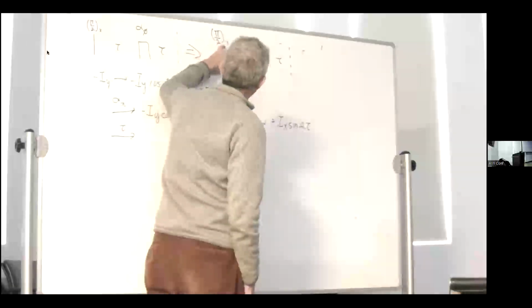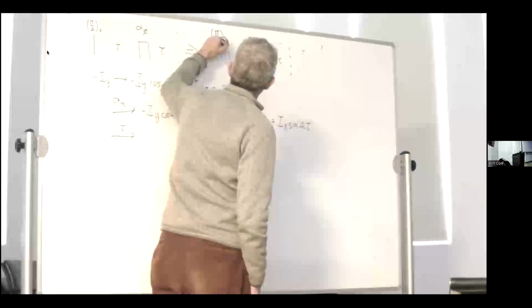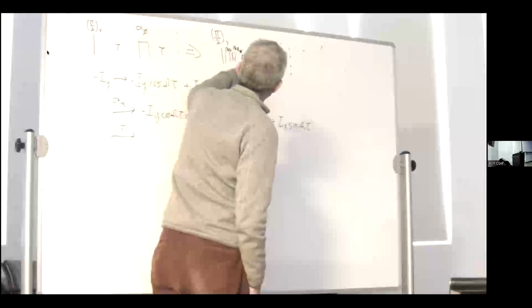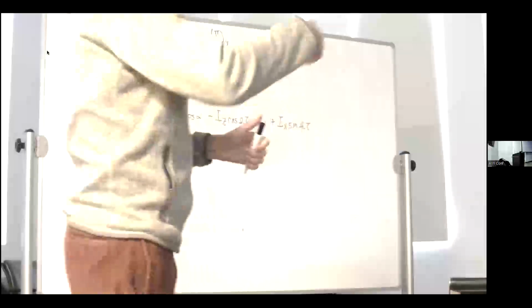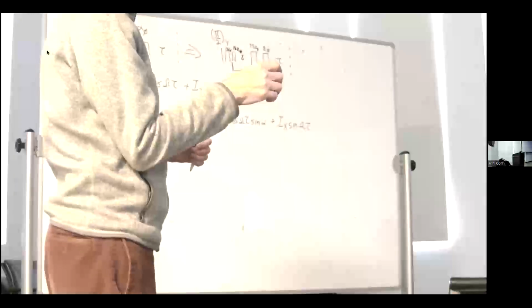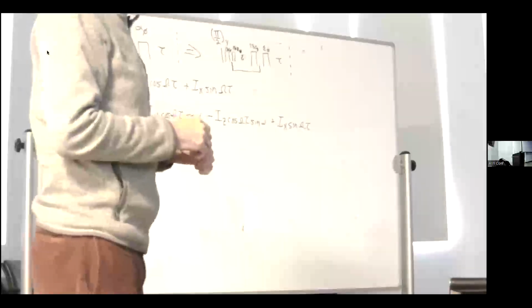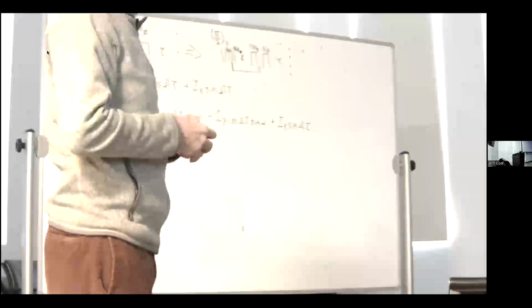And then I imagine sticking in a 180 phi and a 180 minus phi here. And I have this sandwich in which I've applied a 180 y pulse or minus y pulse, and then have my evolution, and then a 180 y pulse. We could work out once and for all what that does.